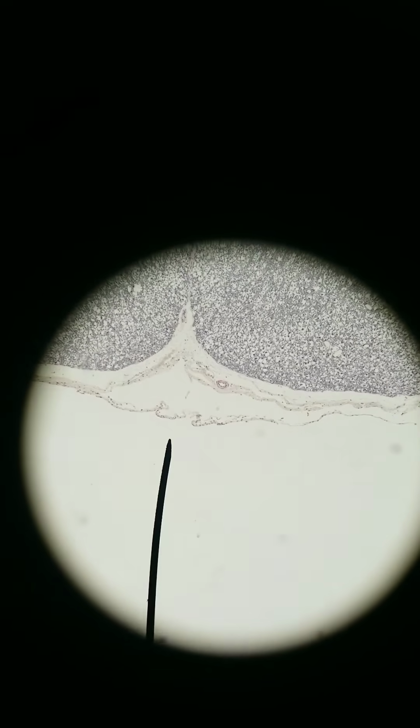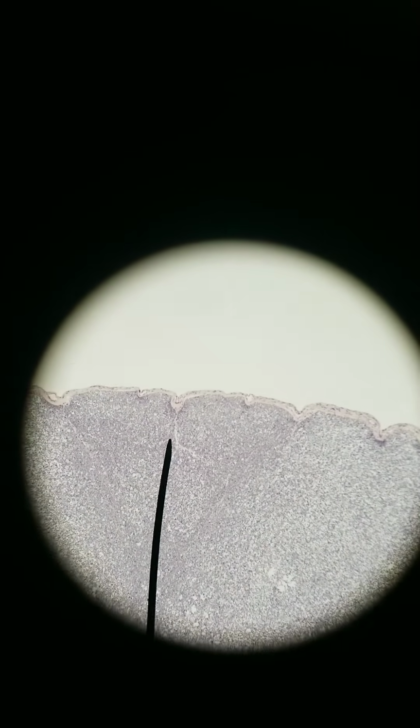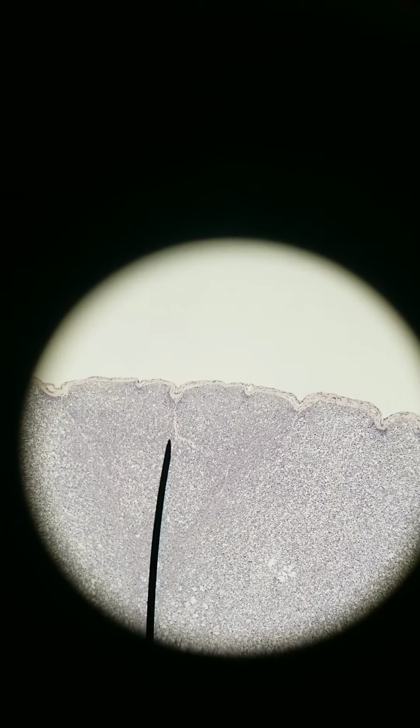If I go to 100X, you can see that a little better. It ends right about here, the anterior median fissure. You can follow this line all the way up and in. So this is the anterior ventral side. And there you can see a blood vessel that's sitting in that fissure. On the posterior dorsal side, it's just a sulcus. So this is the dorsal posterior sulcus. It's just a small fold, but we've got a deep fissure here. That's the anterior fissure.